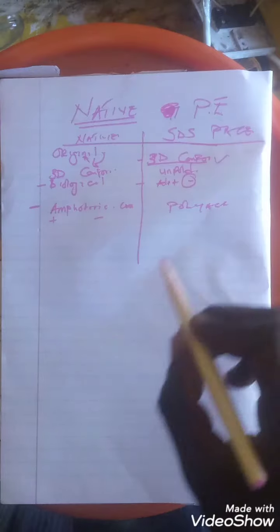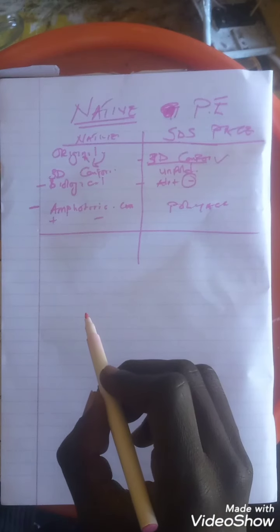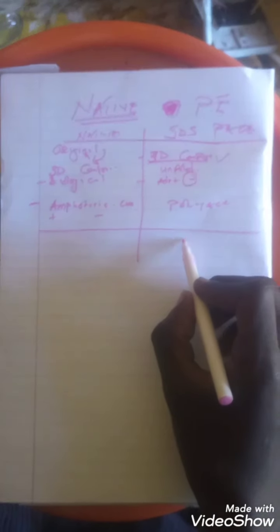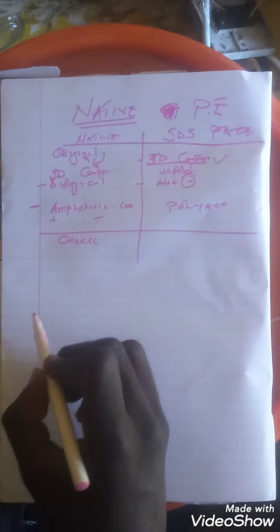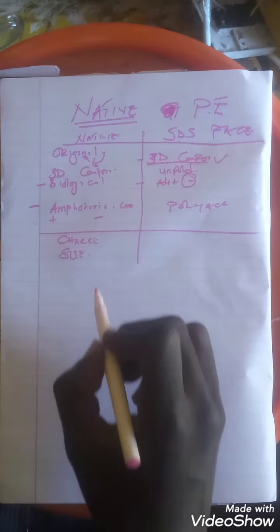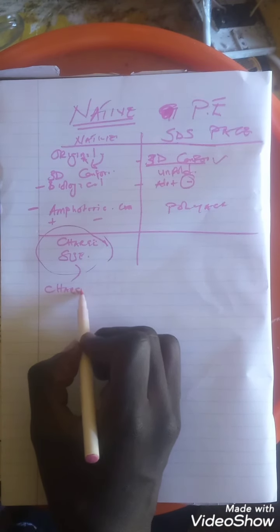They keep their original charges. So in this type of separation, separation is not entirely based on size alone, but charge plays a role, and we can summarize this and say it is the charge density.